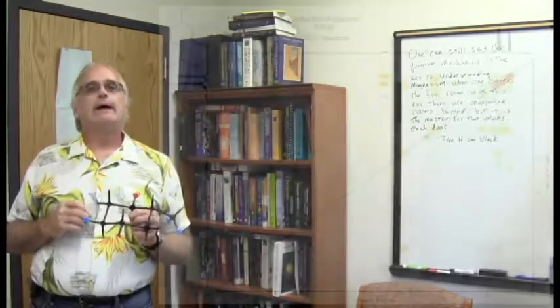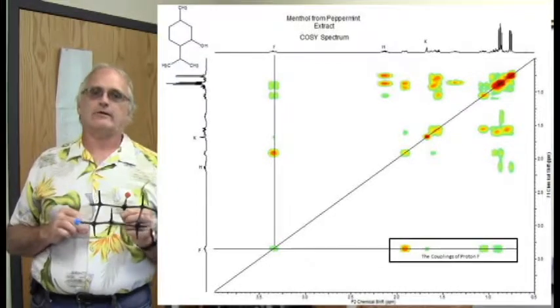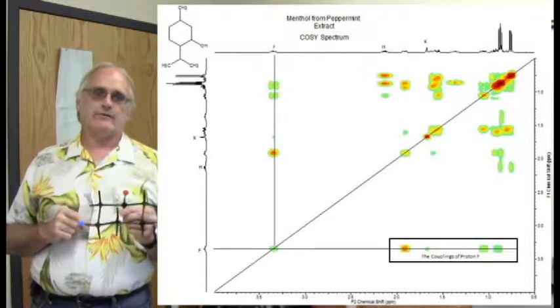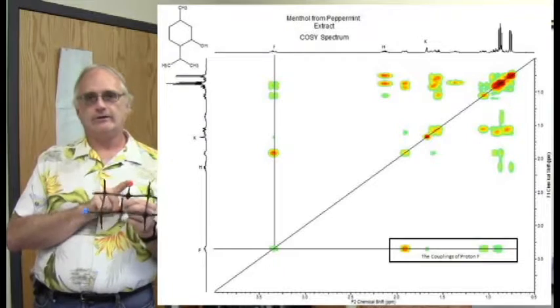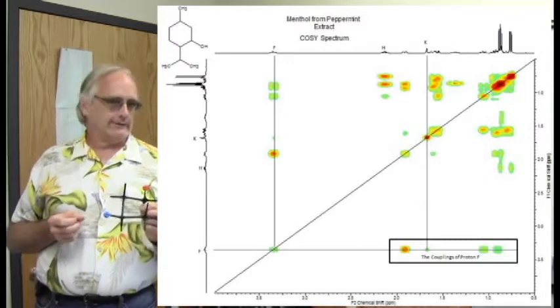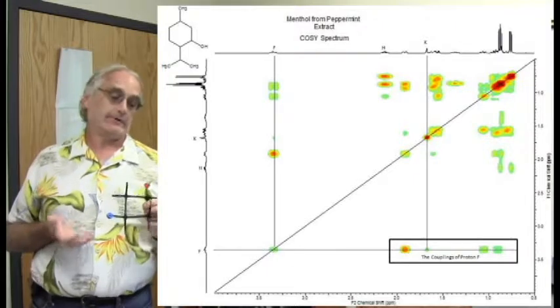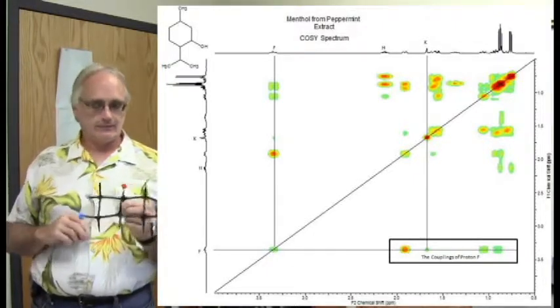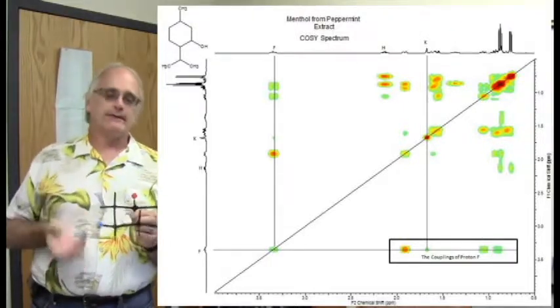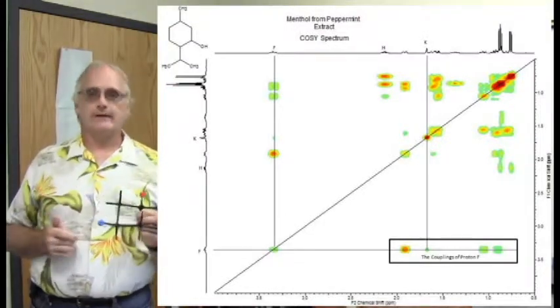And so I bring up the COSY and I take a look at it, and I see that position F actually shows 4 cross peaks, and they're on both sides of the diagonal. I've highlighted them here. Now, one of the cross peaks is kind of interesting. It's actually back to the hydrogen on the oxygen. It's actually back to the alcohol proton. Now, really, the alcohol proton doesn't look like it has much coupling pattern to it, so it must be a very weak coupling constant, but the COSY actually picked it up. There is at least a detectable coupling between them. Weak, but there. But that one I could eliminate, and that leaves 3 cross peaks to these 3 protons.